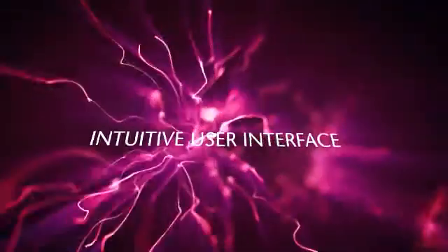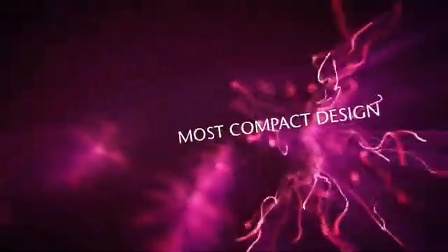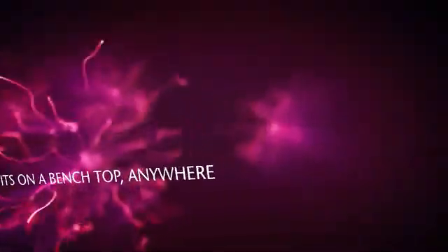The fastest time to image. An intuitive user interface. The most compact design. Fitting on a benchtop anywhere.